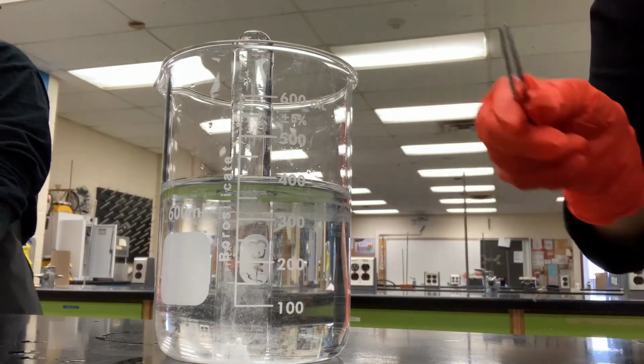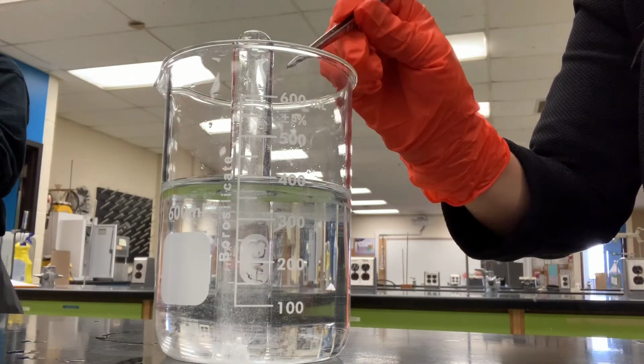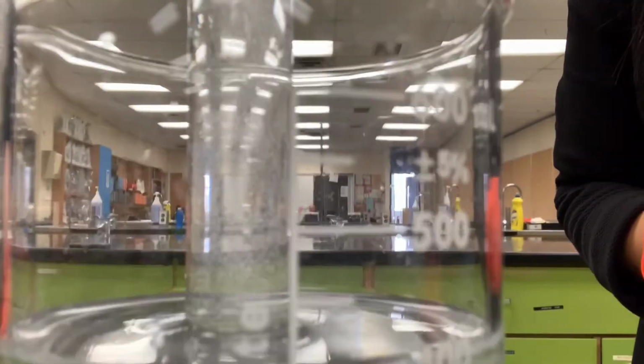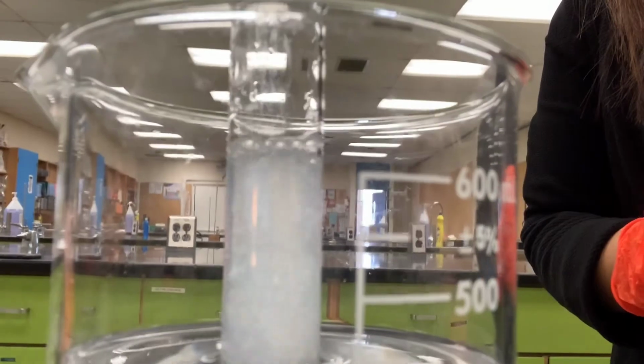What should start to happen is you're going to see some of the bubbling happening. So we're going to displace the water and we're going to trap the gas. We want to completely fill that test tube. Let's see if you can see some of that bubbling happening there. Good. So we're going to completely collect the gas. You can see the water is getting displaced. There we go. The reaction is starting to pick up, and we're collecting the gas. So we're going to let that do its thing and collect an entire test tube of gas.